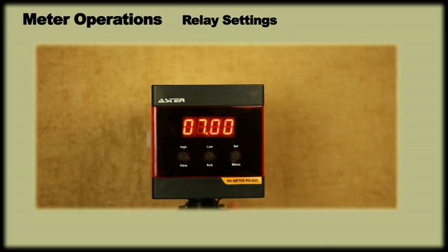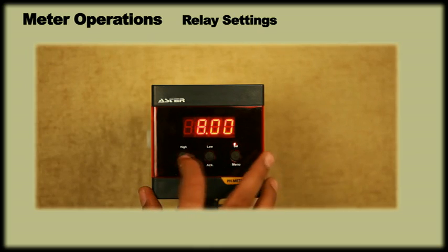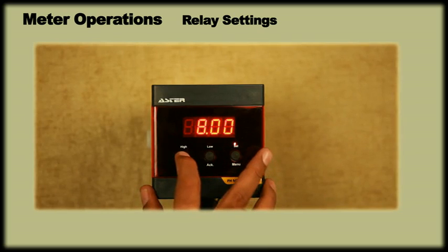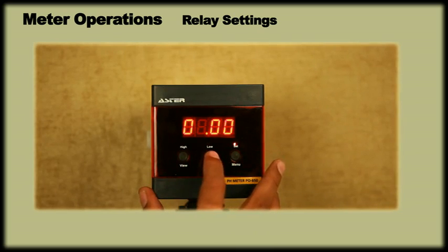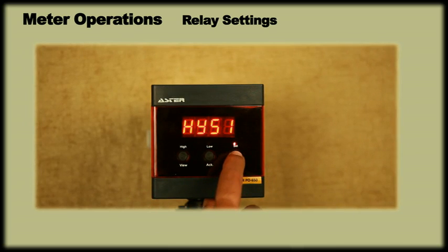How to program set point of pH: Once we press the menu key, it will show set high. Press the menu key, the display will show a previously set high pH value. Using ACK key and view key, we can set the required high pH value. For example, let us set high pH value as 9.00 and press menu to enter. The display will now show hysteresis 1.